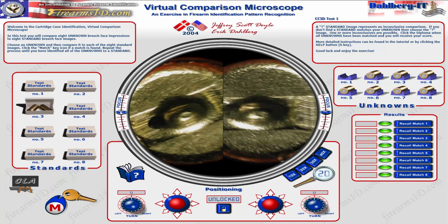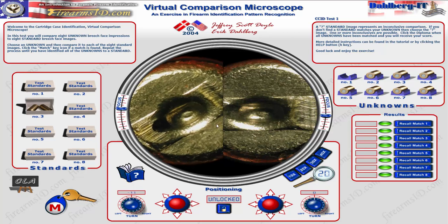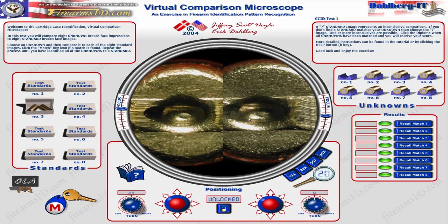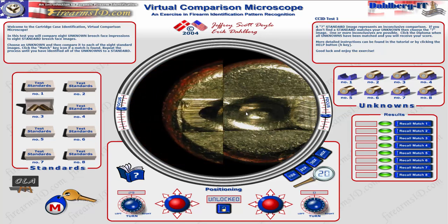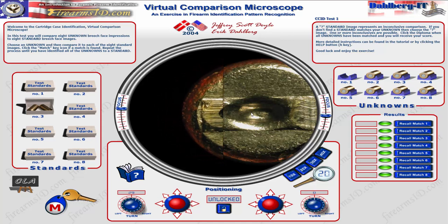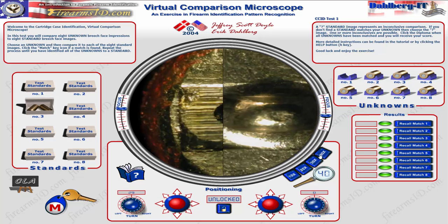Now I'll show you what I would do. I've already figured out ahead of time that these two belong together. I'm going to focus one cartridge case and then the other. I can see some lines, so I'll rotate them to line them up in both windows, then slide them so the corresponding parts align. I'll increase my magnification to get a closer look and keep lining them up.